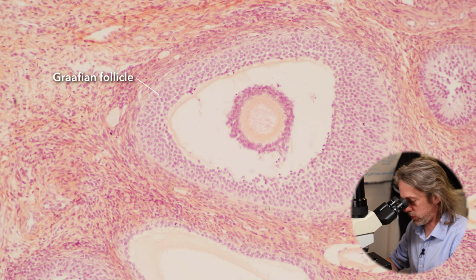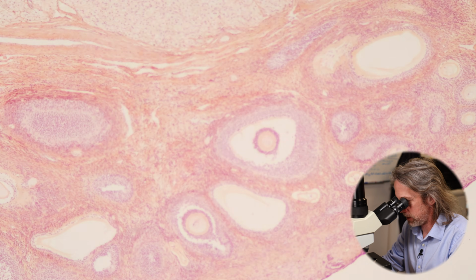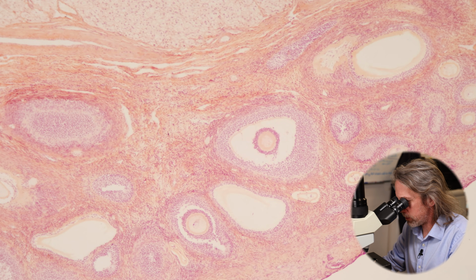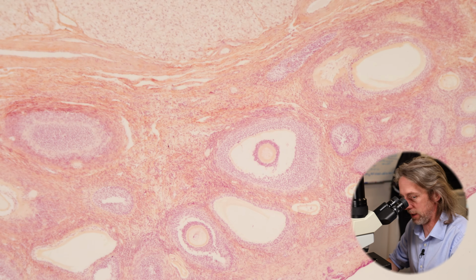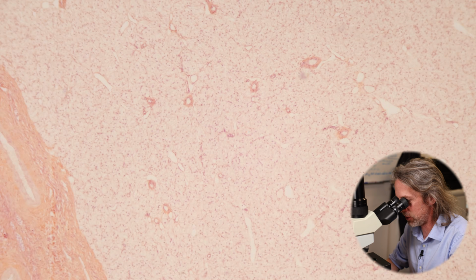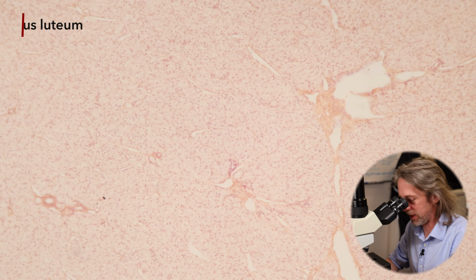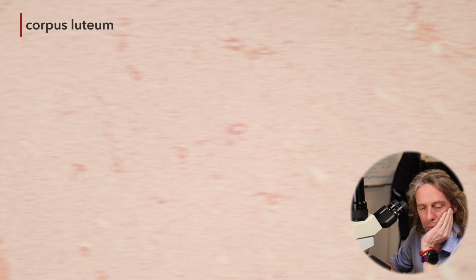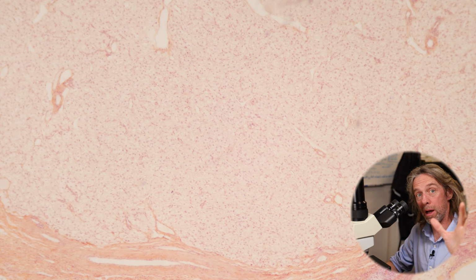and so on. So if I zoom back out again to give you a sense of scale, this is back to my 4 times objective, 10 times to my eyes, so 40 times magnification for me. This is the elephant in the room. This huge great big space, this huge great big thing in the middle that I haven't talked about. This is the corpus luteum. This is what's left after the oocyte is ovulated.